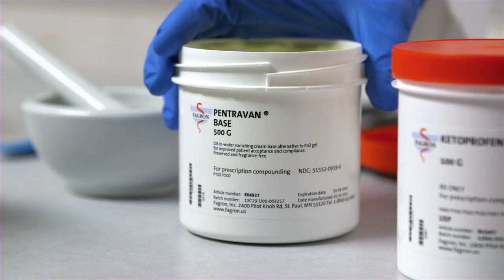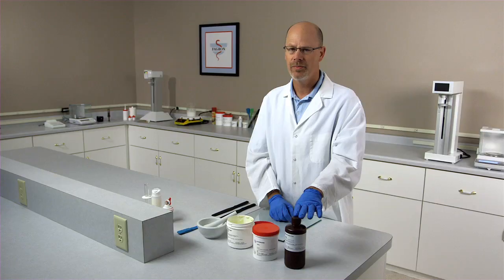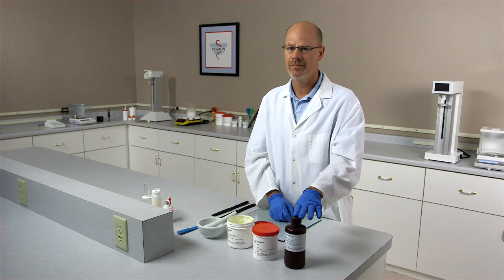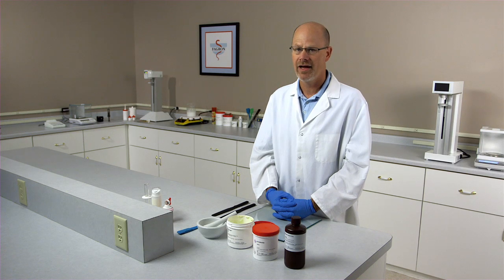The items we will need are Pentravan, Ketoprofen, and a suitable solvent. With Ketoprofen, you have a couple of solvents to pick from. Ethanol can be used, but the preferred solvent is ethoxidiglycol.